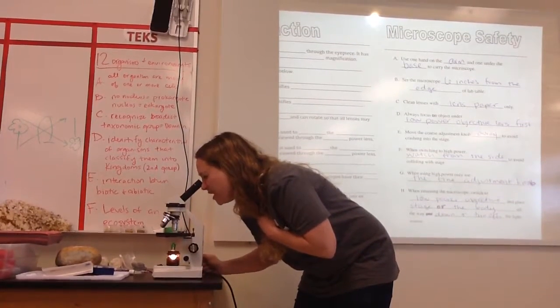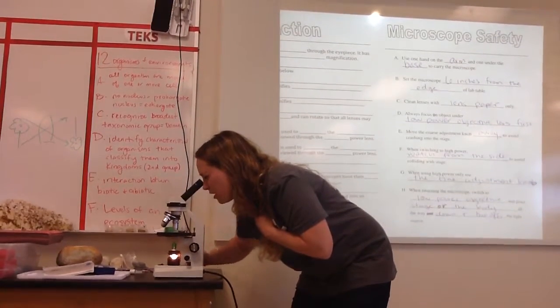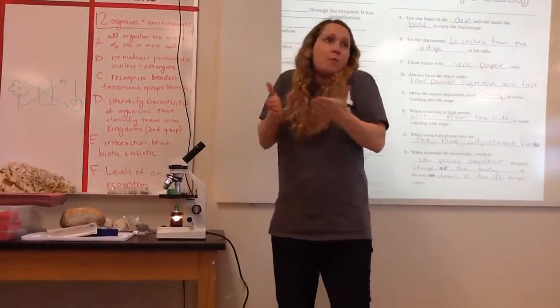Oh, there it is again. Let's try the fine knob and see if I can make it any better in focus. Looks great. I'm going to take my observations. Does that make sense? Now I want to switch to the bigger power.